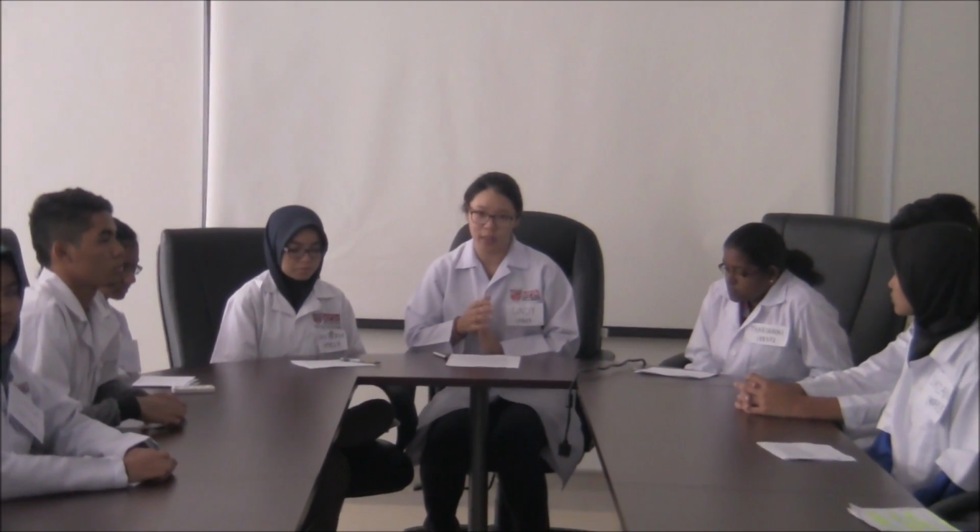Thanks to the final speakers. Before we end this discussion, please allow me to summarize the main points of today's discussion. We have discussed that spectrophotometry is the method to measure how much a chemical substance absorbs light, and also the principle of it is that the compound absorbs light over a certain range of wavelength. We also discussed the structures of spectrophotometer, where it consists of light source, monochromator, wavelength selector, sample container, photoelectric detector, and digital display with their respective functions.